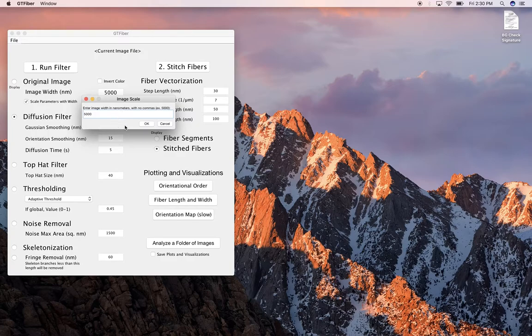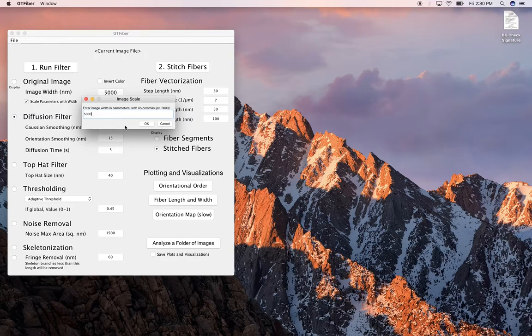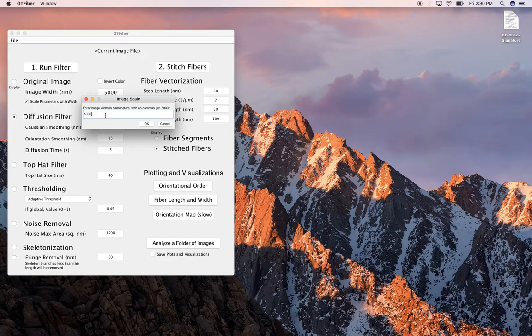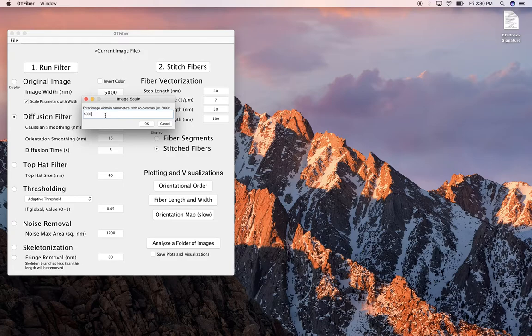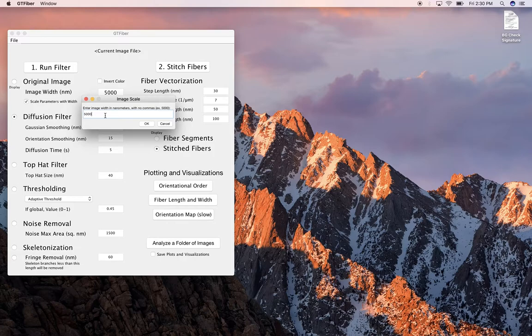If your image is a really large image, if it's measured kind of on the scale of millimeters, you want this number to be somewhere in the thousands. Let's say that your image was 5 millimeters for some reason, maybe you're looking at a different scale of fibers. I would still put in 5,000 and then I would treat everything as a micron. Everywhere that it says nanometer, I would treat that as a micron. I don't really have support for different length scales like that, but for now, we're just going to put in 5,000. That's 5,000 nanometers.